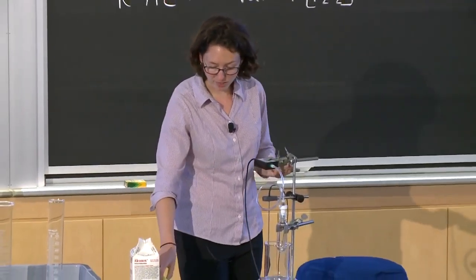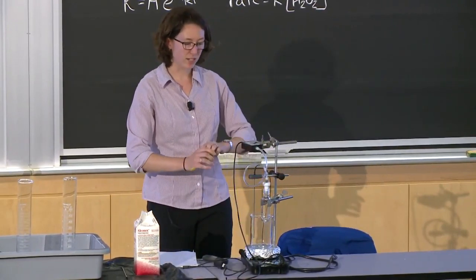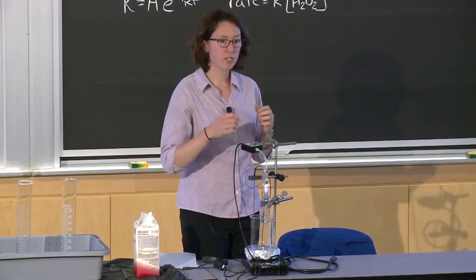The other important thing about this reaction for day 1 and day 2, and I'm sure your TAs will emphasize this when they tell you in lab and you guys have a chance to have this in front of you, but it is to do everything really quickly.